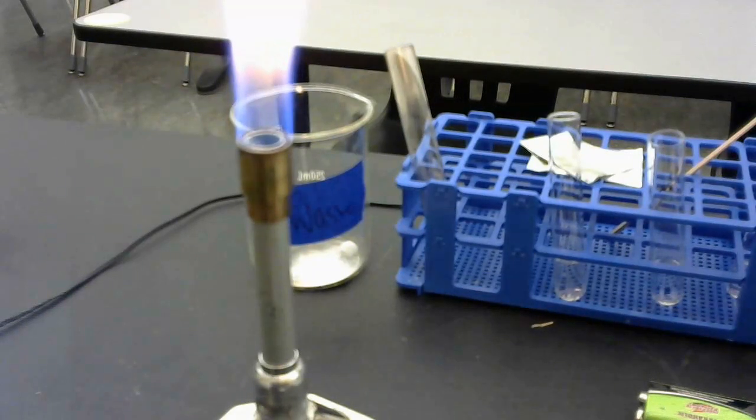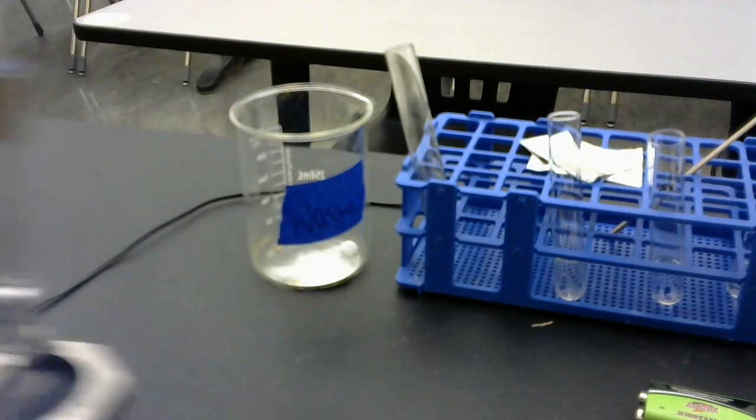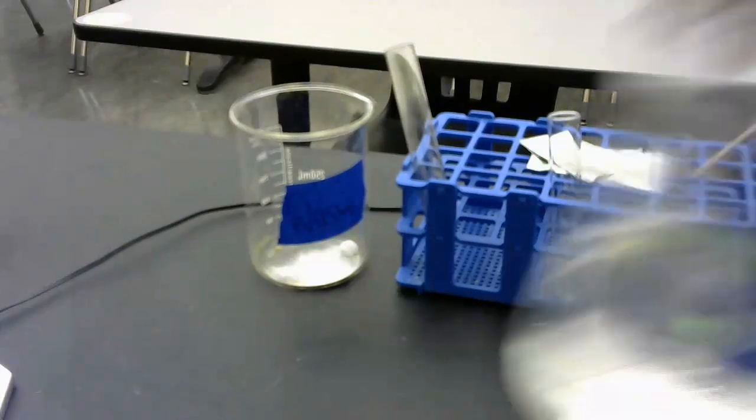So I'm going to turn off my flame because I don't need it right now, and I'm going to move my Bunsen burner to the side. Okay, and then I'm going to bring over my water.